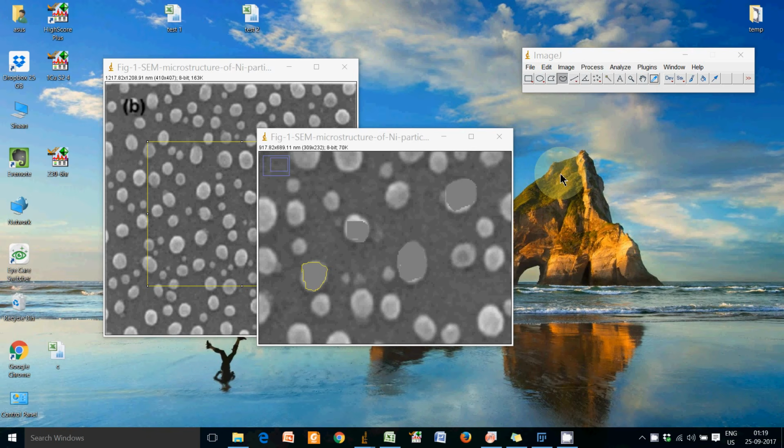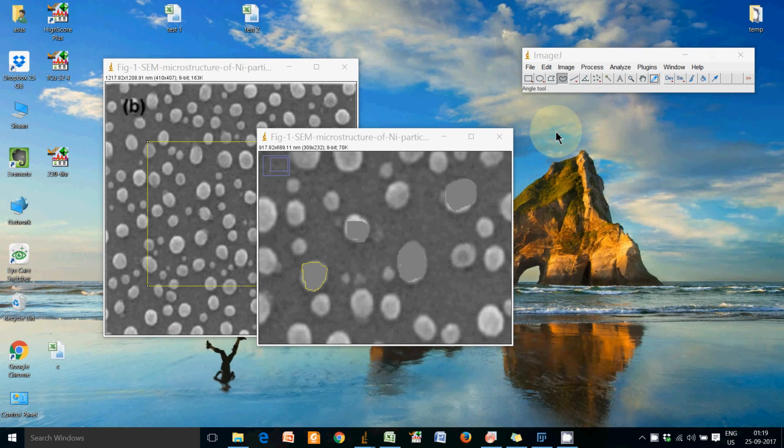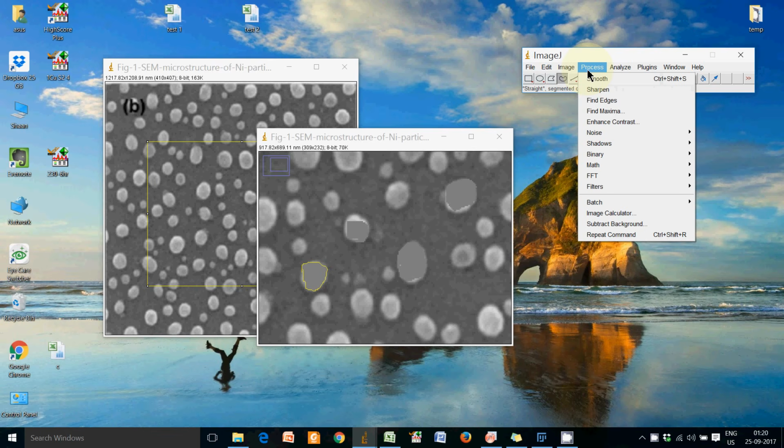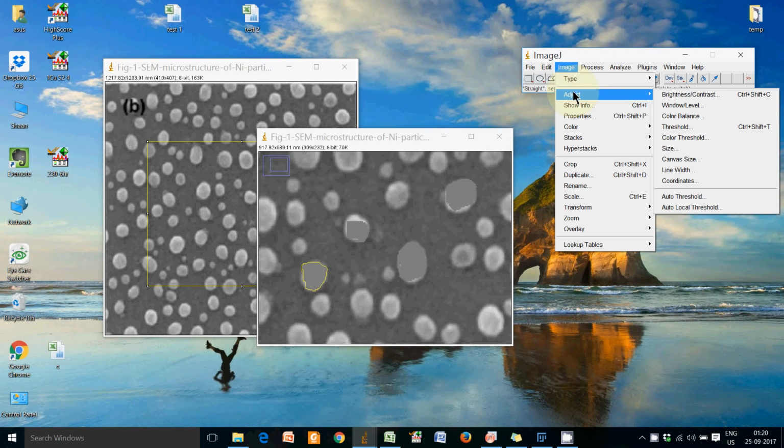In our coming tutorial, I will be demonstrating these functions, and I will show how to convert any image that is initially not possible to threshold, but after using this function we can threshold it. And obviously it will be time saving to use the threshold function rather than doing it manually, because the thresholding is automatically taking care of all the particles one at a time.